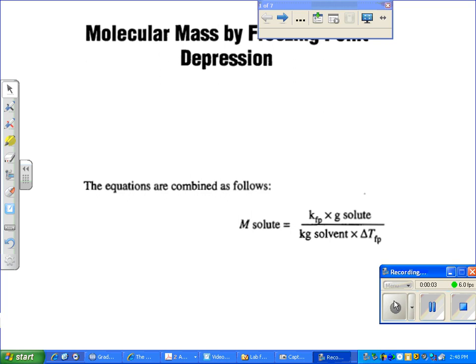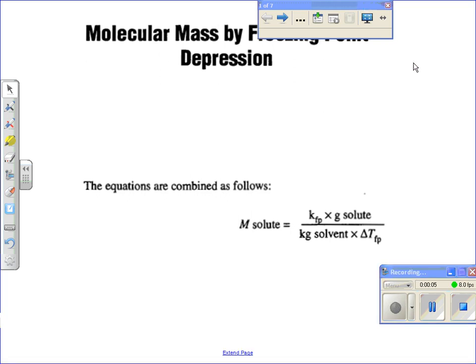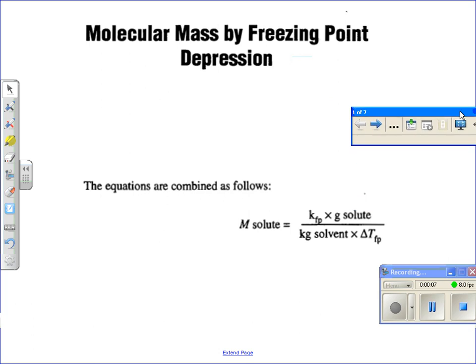All right, so this video is going to serve as a pre-lab to the molar mass by freezing point depression method that we're going to do tomorrow. So you need to make sure you watch the video. There will be a short quiz before the lab starts tomorrow, so make sure you can answer some key questions.